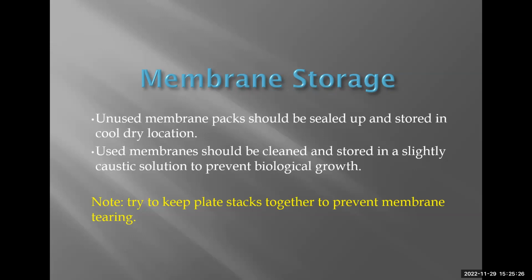And the other thing that you should note is if you're ever dealing with plate and frame membranes, try to keep the plate stacks together to prevent the membranes from tearing. So if you're changing from a plate and frame membrane stack to a spiral membrane stack, you're going to want to keep the plate stack together since they're usually compressed very tightly together. And because of that, the polymers tend to stick to each other. So when you try to pull apart the plate stacks, you'll usually rip the membranes.